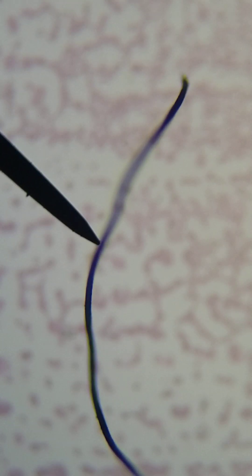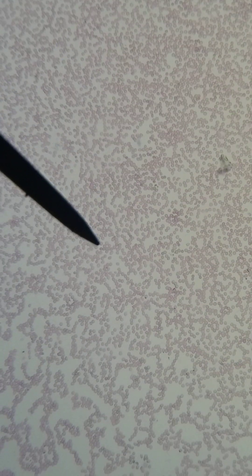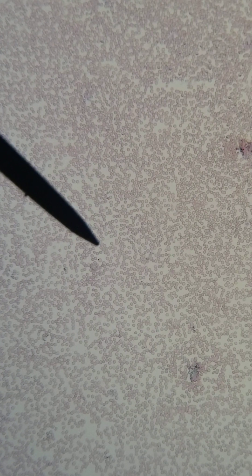That is nothing — that is not a worm. I wanted to make sure to have that in the video, but see, it's occluding. It's not even in the same plane as the blood. So that's just a fiber sitting on top. All right, so we are still on 10x, scanning our slide like good laboratorians do.